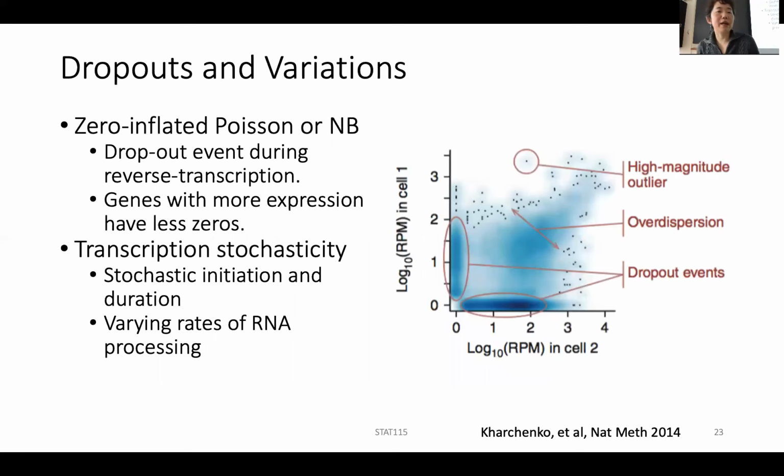And so for that, we have to understand the unique properties of single cell RNA-seq. This is from an early review, but I think it captures the result from single cell in general. If you get the readout of the RPM, reads per million, in that single cell, you can ask, for every gene, how much read count is landing there.